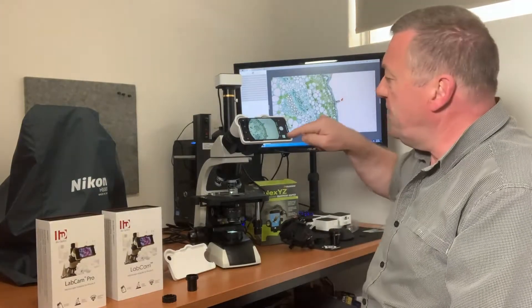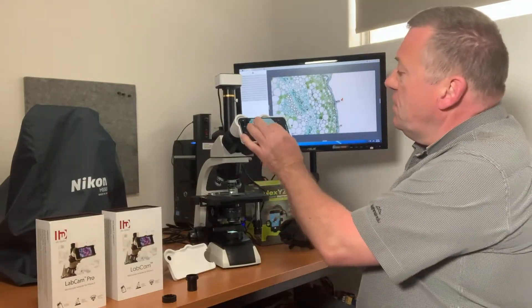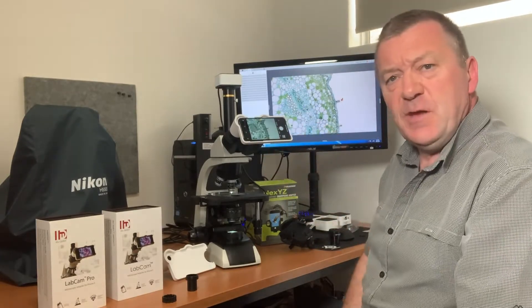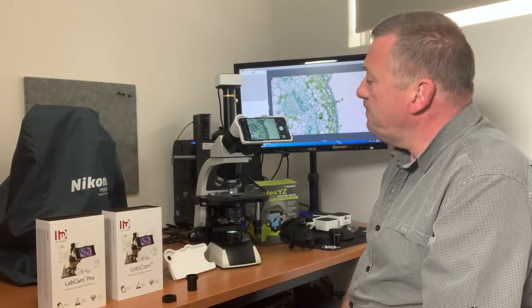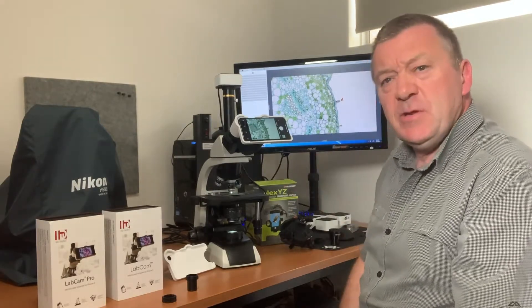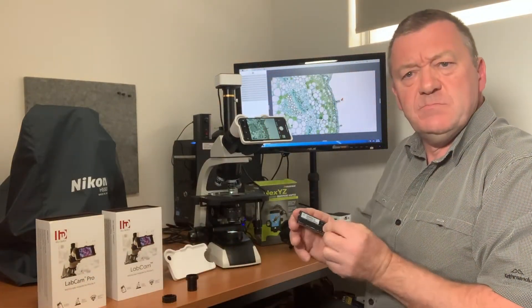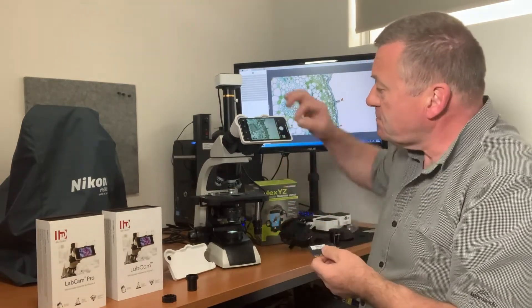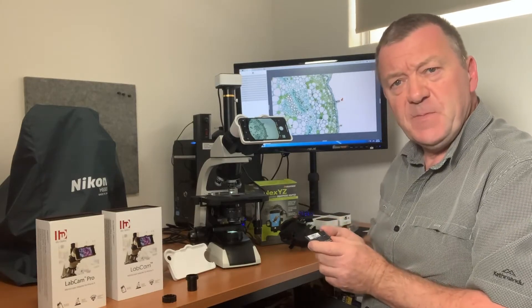The difference you see with the Pro is that the field of view is much larger — you see more of your specimen — and you can zoom in and take pictures and video as well, with very good quality image reproduction. I did find that the downside of the Pro version is that when looking at very angular specimens under a stereo microscope — for example a small PCB board — there is a lot of curvature on the outside edges, which is eliminated when you zoom into your specimen.